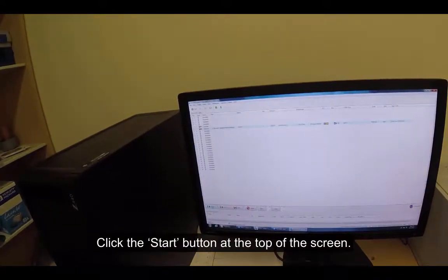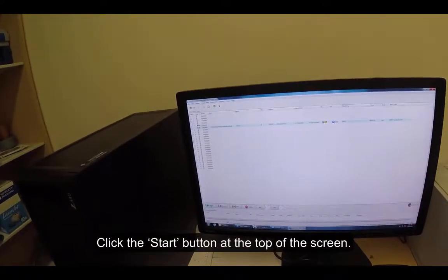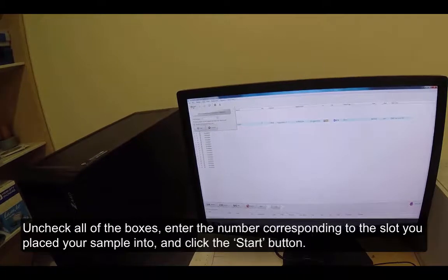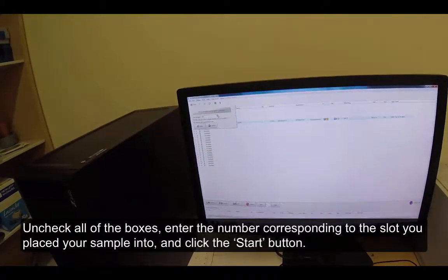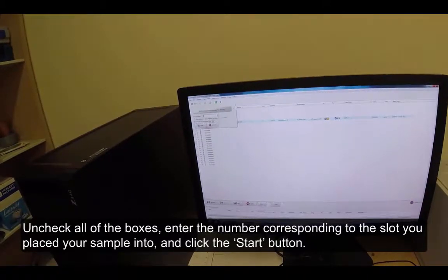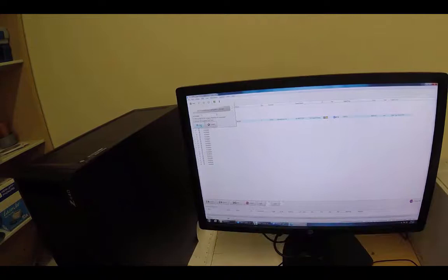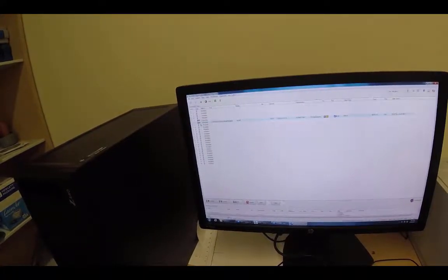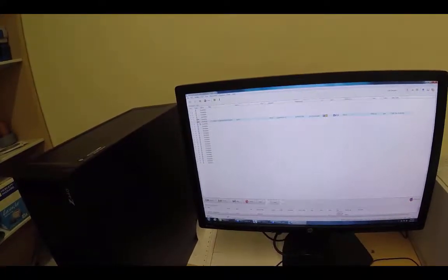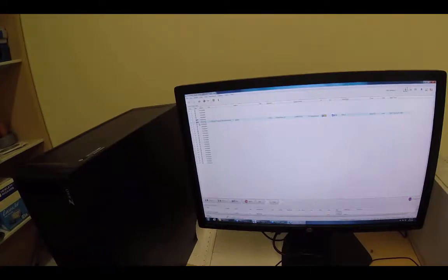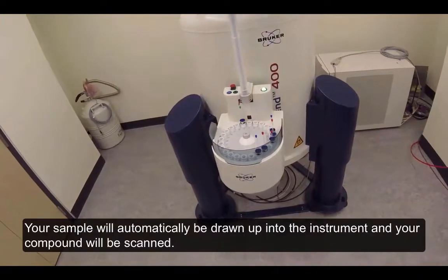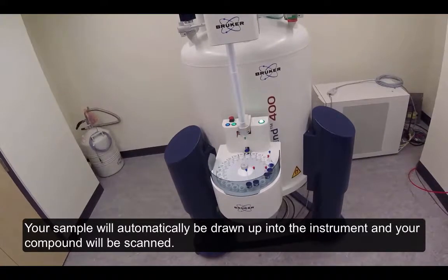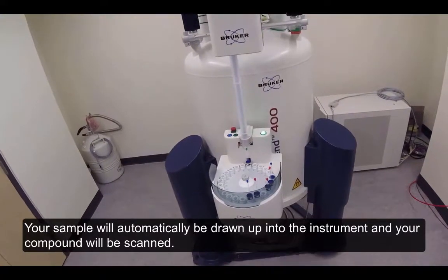Click the Submit button at the bottom of the screen. Click the Start button at the top of the screen. Uncheck all of the boxes, enter the number corresponding to the slot you placed your sample into, and click the Start button. Your sample will automatically be drawn up into the instrument and your compound will be scanned.